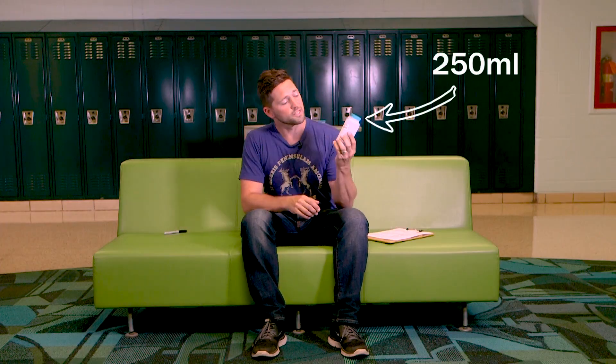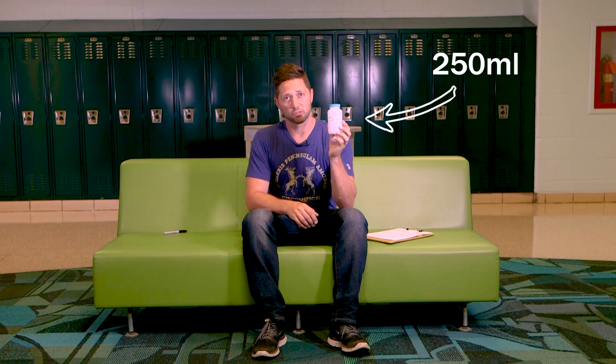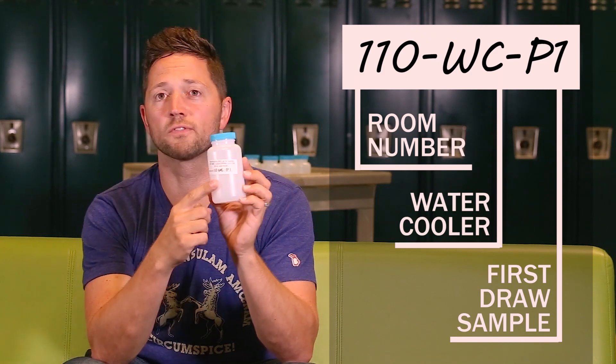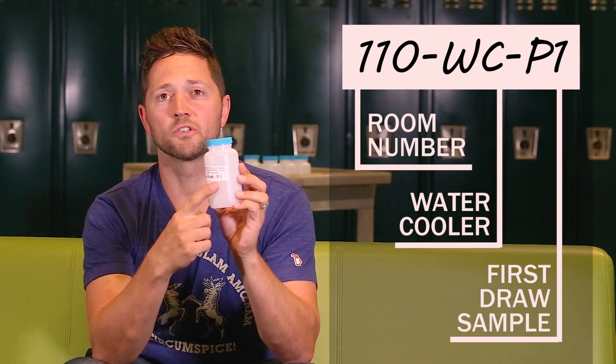With proper training anyone can collect lead and copper samples. You don't need a certified operator, however samples should be collected in a specific way in order to give you the best results. For investigative sampling use 250 milliliter bottles like these — these are different than the bottles you use for compliance sampling. The bottle should be labeled with the ID number: 110 is the room number, WC is for water cooler, and P1 is the first draw sample.